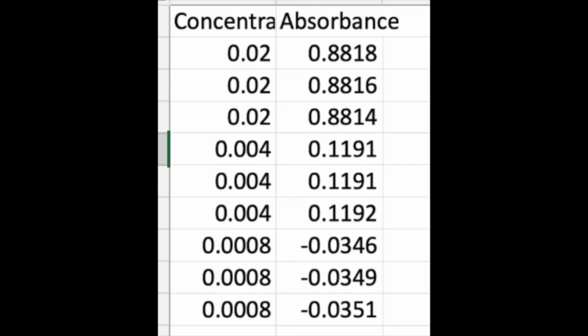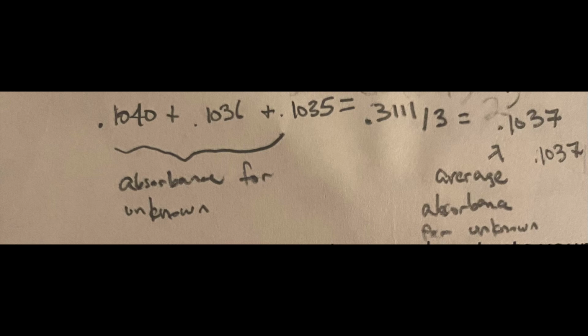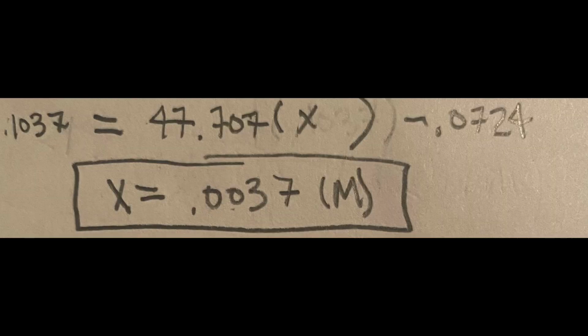We plugged all the data from the solutions that we made into Excel to make this fancy chart. We then took all the data from our unknown and found the average absorbance and plugged it into our chart to find the unknown molarity.